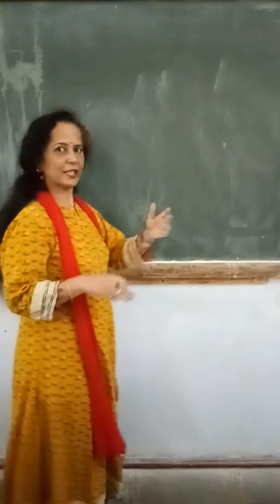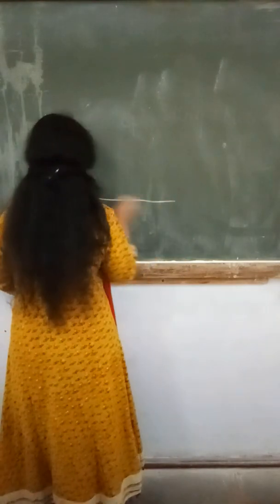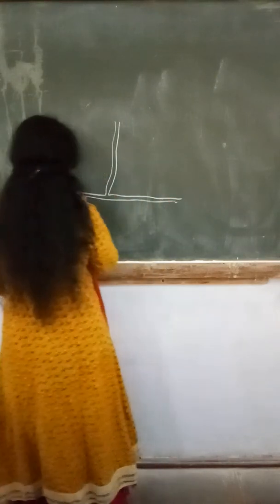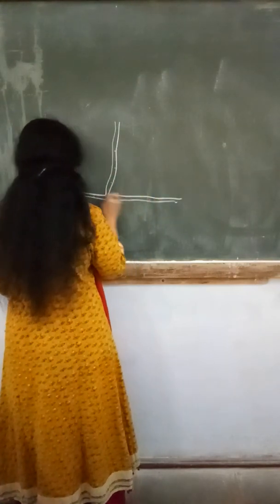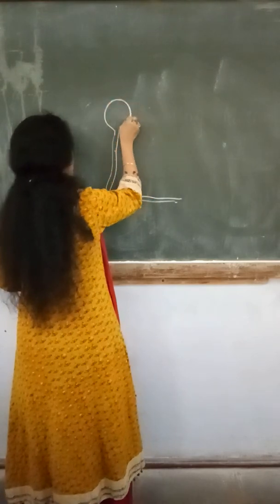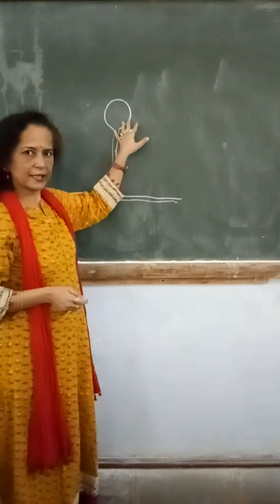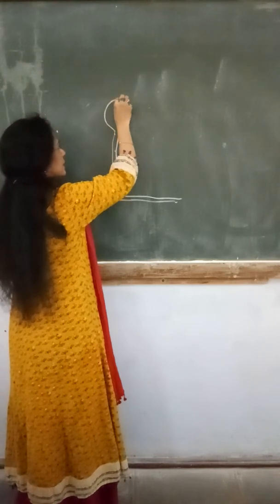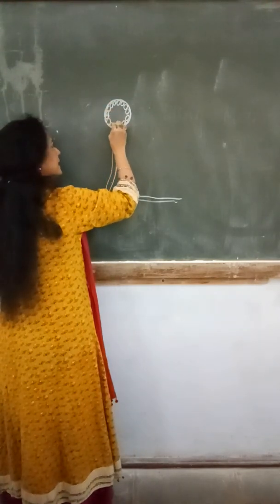Okay. So first of all, we will try to see the lower fungi and their structure, their somatic part, their spore structure and everything. Our lower fungi has coenocytic hyphae, which has many nuclei in the hypha, but it will not have any separation or differentiation of the fungal cell. At the tip of this sporangiophore, there will be a globose structure, and this structure will contain the asexual spores which are called sporangiospores. The entire sac-like structure is completely filled by the spores like this.